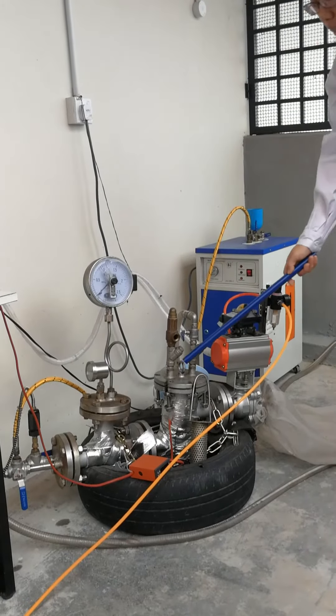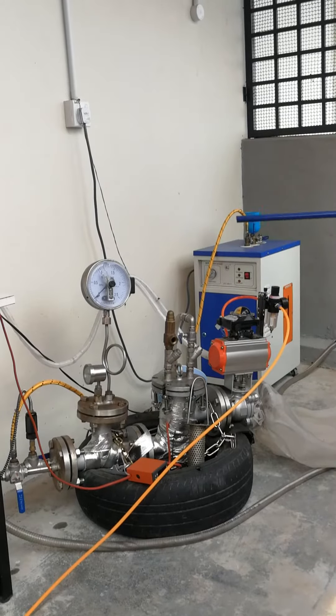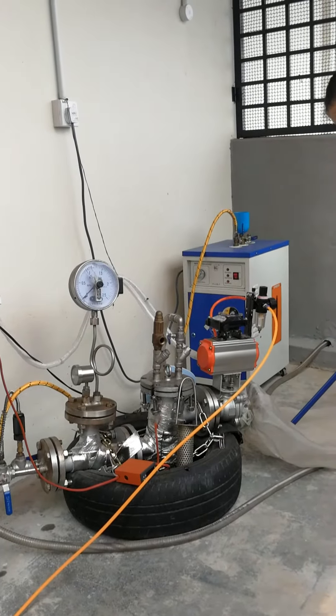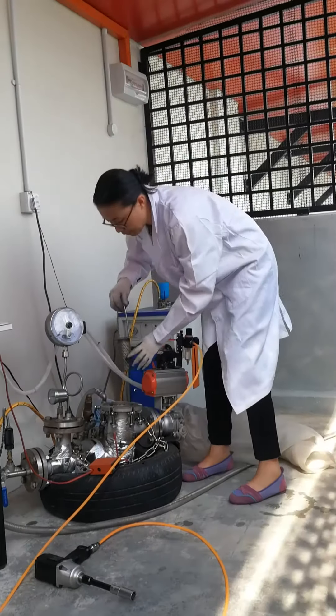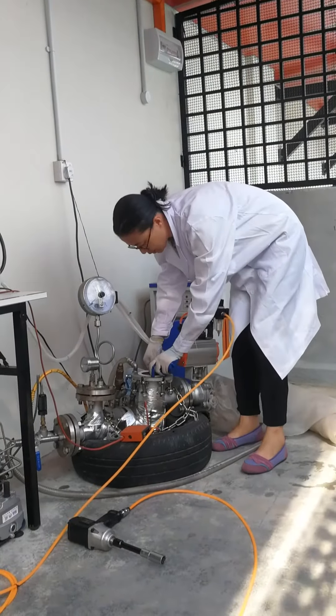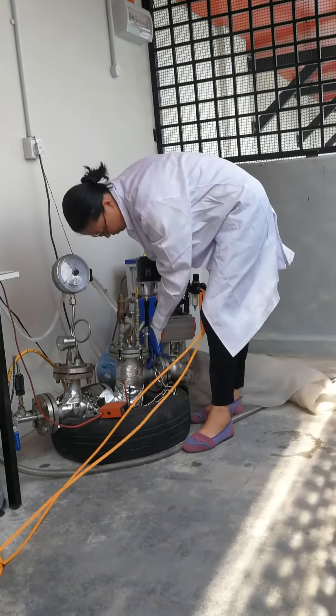After finishing the process, the material is outlet through the pneumatic valve immediately and collected inside the sample collector. To start the process, we load the sample and put it inside the reactor. We seal the reactor, bind the nuts, and tighten the nuts.